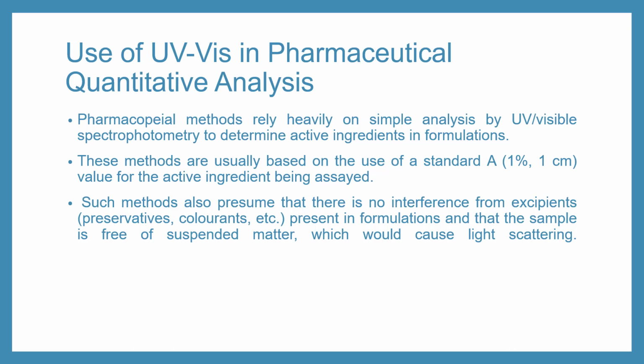So you have no interference from excipients, okay? So your preservatives, your colorants, your bulking agent, etc. are not absorbing at that wavelength. And it's also assuming that you have a perfectly dissolved sample. So you have no suspended matter which would cause light scattering.